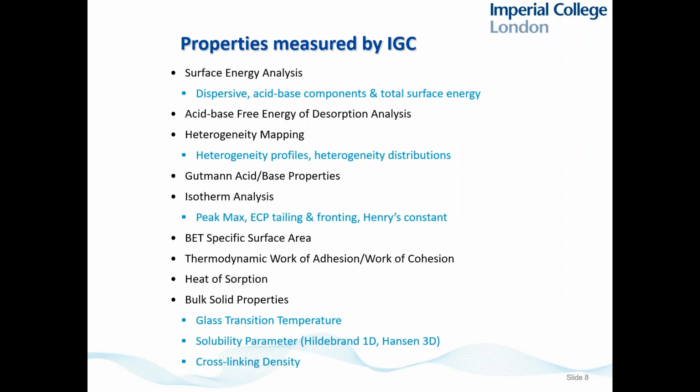Now, there is a very large range of properties we can measure. We are not going to discuss many of these today, probably three. We're going to talk about the surface energy, and I'll explain what that is in a moment. We're going to talk about surface area, and I'll remind you about that in a moment. Today we'll do BET surface area and surface energy, just two things you can measure using this approach.